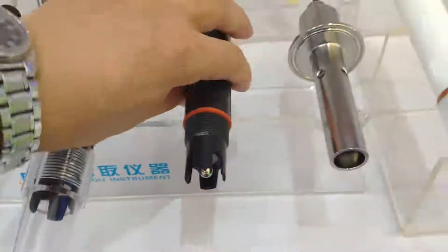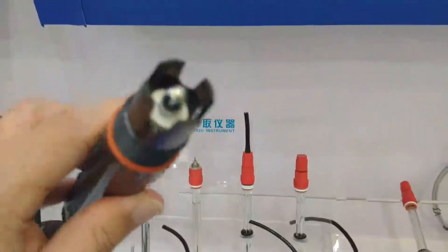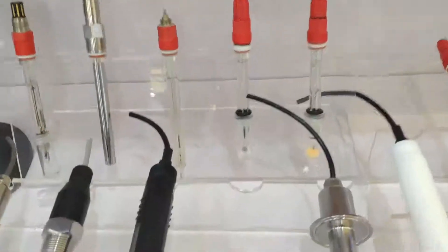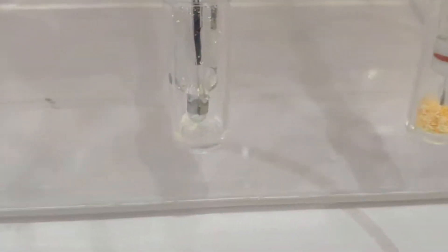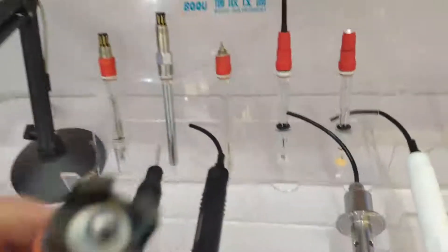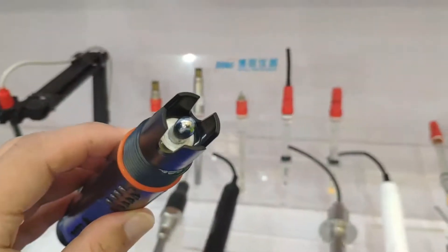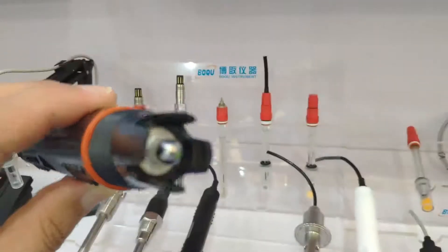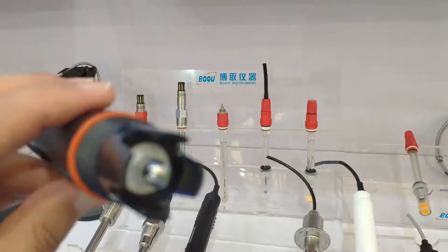Here is a special pH sensor — the Antimony pH sensor. Normally, the pH sensor is with a glass membrane, but this special pH sensor uses an antimony membrane. It's designed for special use with HF acid.